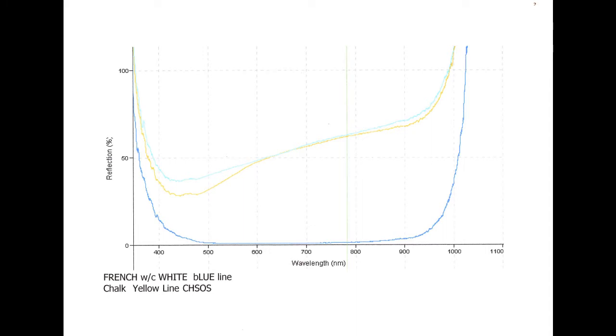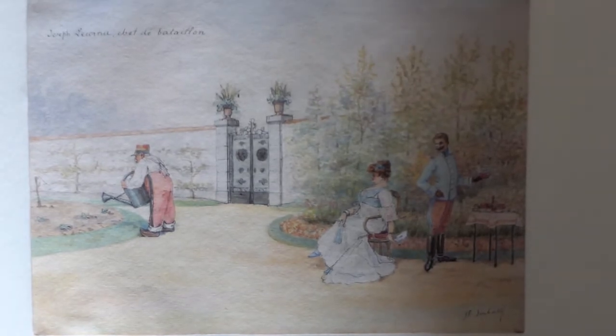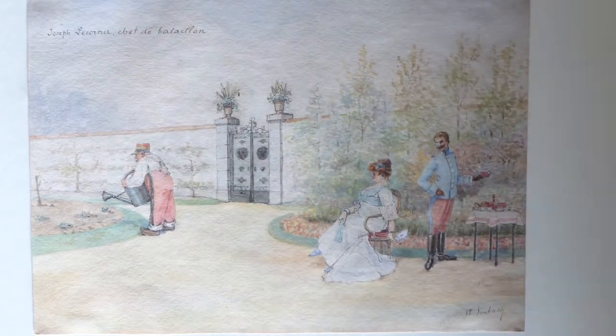The top bluish spectra matches the yellow CHSOS spectra for chalk. So we can be fairly certain that the white is in fact a mix of lead white and chalk white. And there's just a possibility the artist has used a gesso preparation, but unlikely, as we would expect it to be used as a ground covering the whole surface.